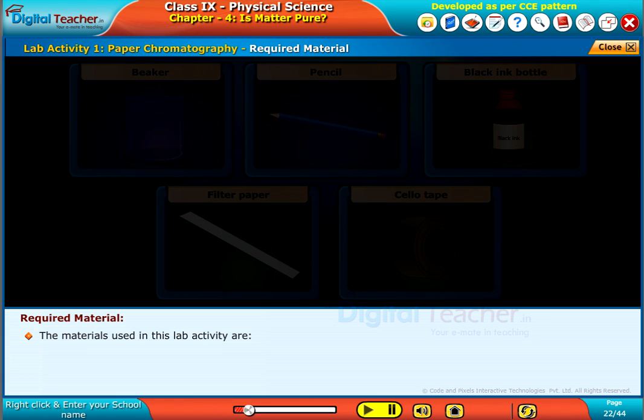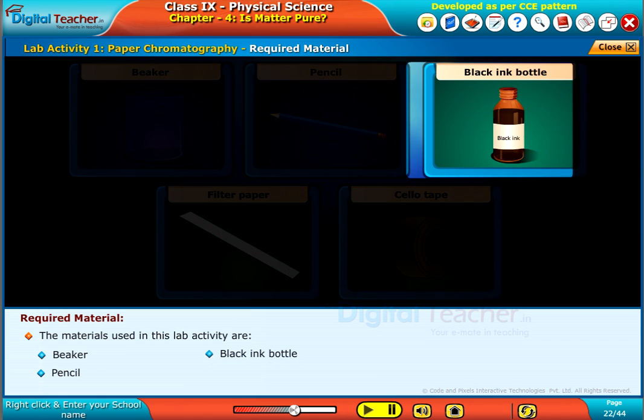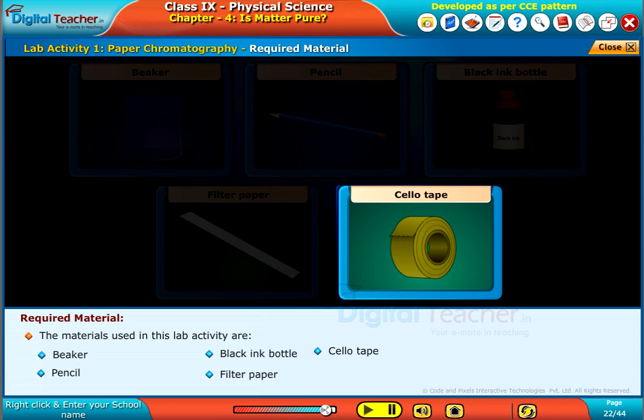The materials used in this lab activity are beaker, pencil, black ink bottle, filter paper, cellotape.